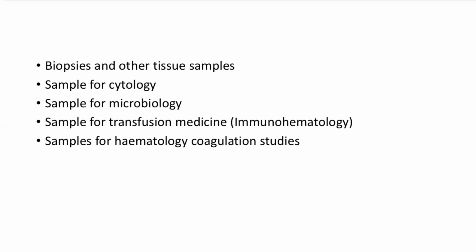Cytological sample, you are collecting sample for pap smear, you are collecting samples. This FNAC, you are collecting through FNAC from various areas, or similar to EBUS, endoscopic GI ultrasound is also there. They are also collecting from mediastinum growth, or they are collecting gastric biopsies. Gynecologists are also collecting so many endometrial washing, endometrial biopsy.